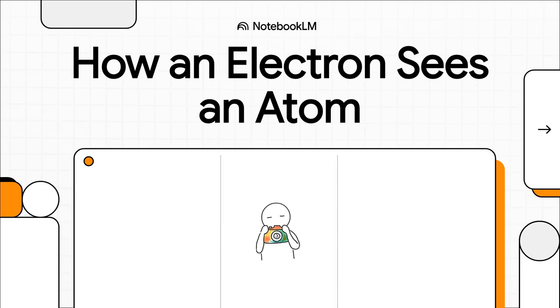Okay, so how do you take a picture of something that's literally smaller than a wavelength of light? I mean, you can't, right? Well, you can. The answer is an electron microscope. But the way it works, it's a deep dive into some of the absolute weirdest corners of quantum physics.